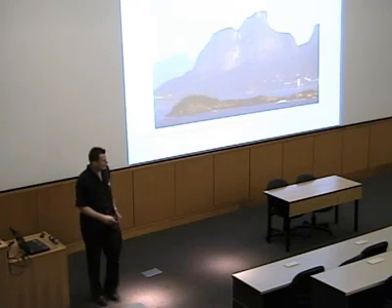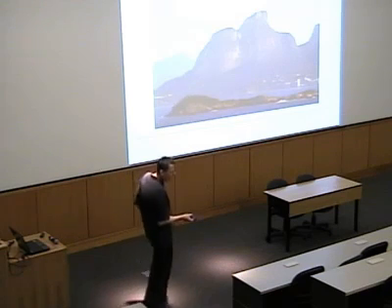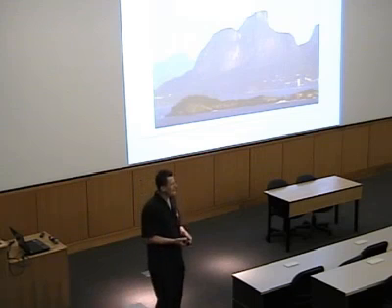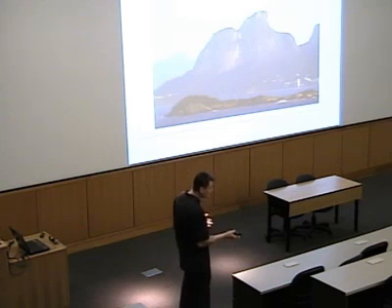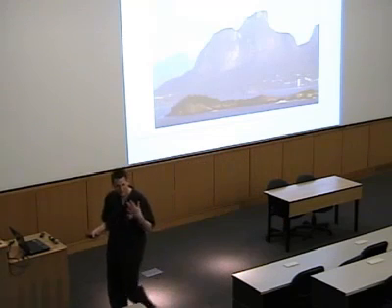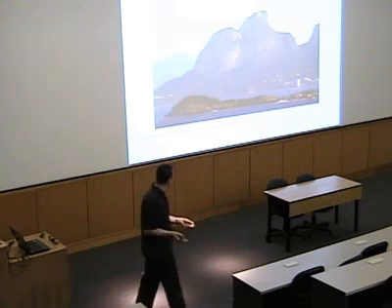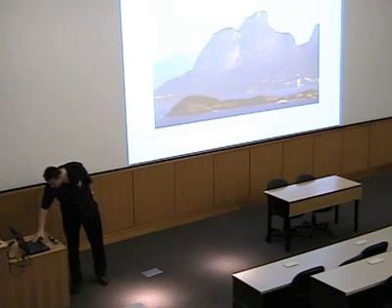I always call MCD the sleeping giant, right? I like this picture here. MCD is a very powerful technique, but it's also quite exotic, so it is not that widespread or often used. But there's a lot of information you can get from MCD spectra: spectral resolution, and you can also optically detect magnetic saturation curves. You can get information about the magnetic properties of your ground states. You can get polarizations of your optical transitions in samples of randomly oriented molecules, so without single crystals you can do something like single crystal spectroscopy. You can get polarization information. So there's a lot of unexplored potential. MCD is still a sleeping giant, so I hope I can help the giant wake up and rise this morning, and maybe you will get interested in using MCD for your own research.